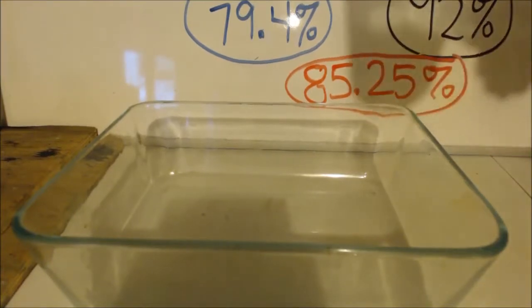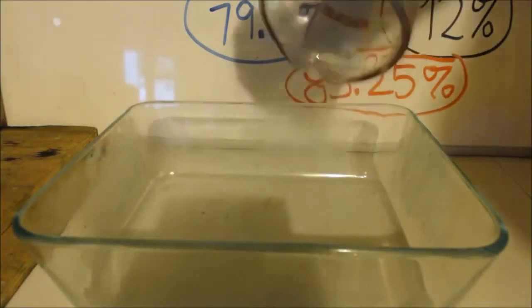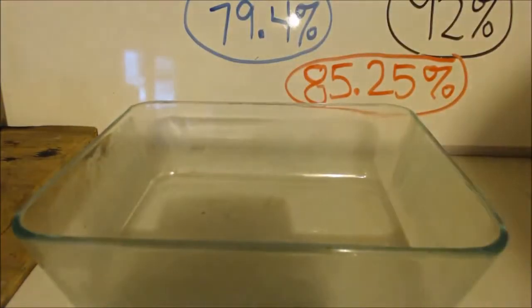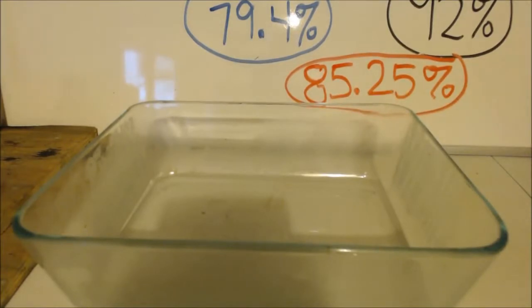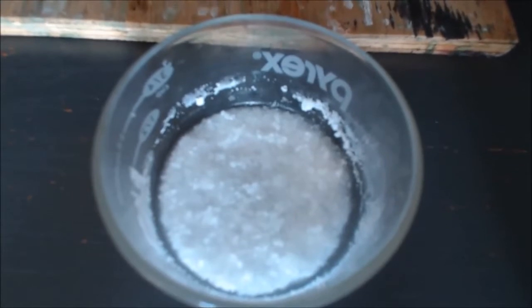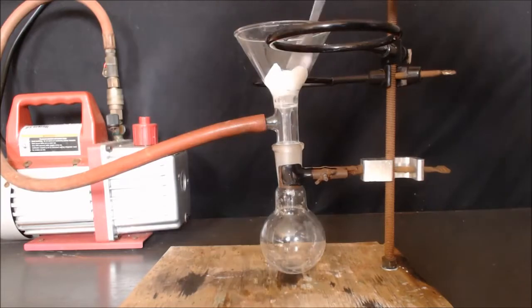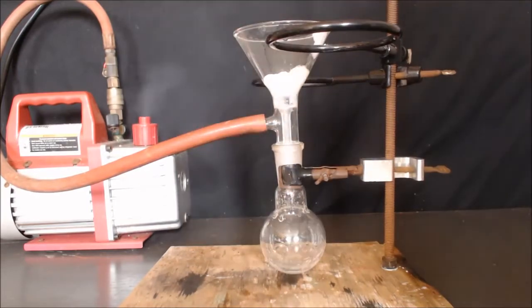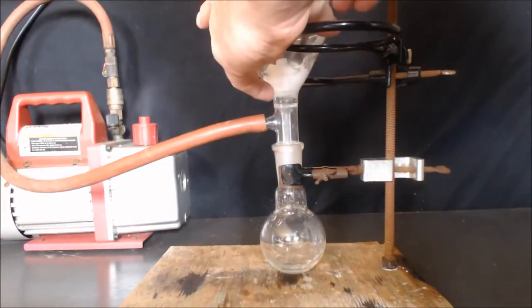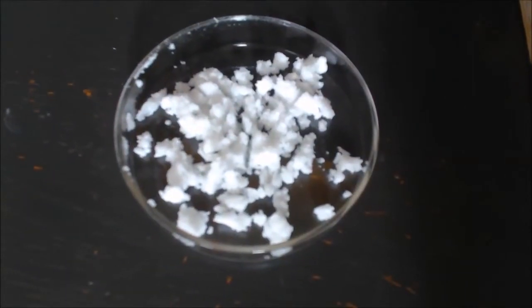I heated this up and I'm going to pour it into this container and let it cool down and evaporate. It's nice and hot and has a lot of surface area — it should evaporate within a day or so. As you can see, there are beautiful white crystals.